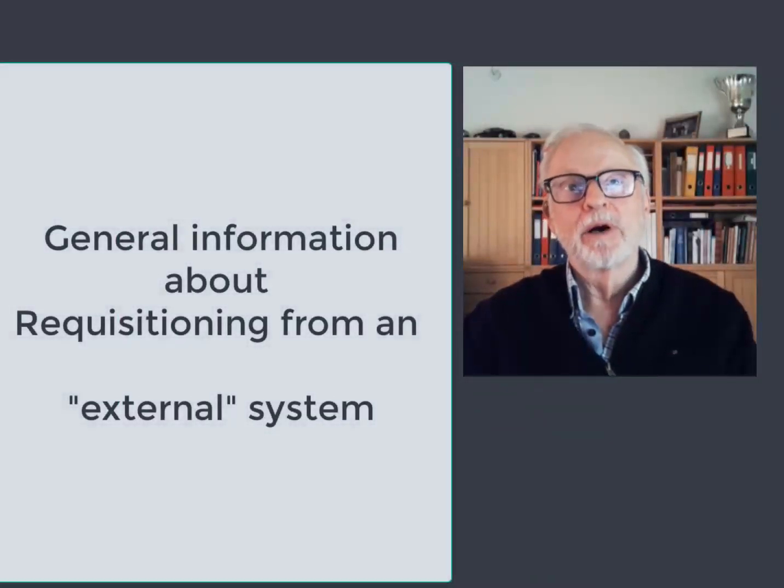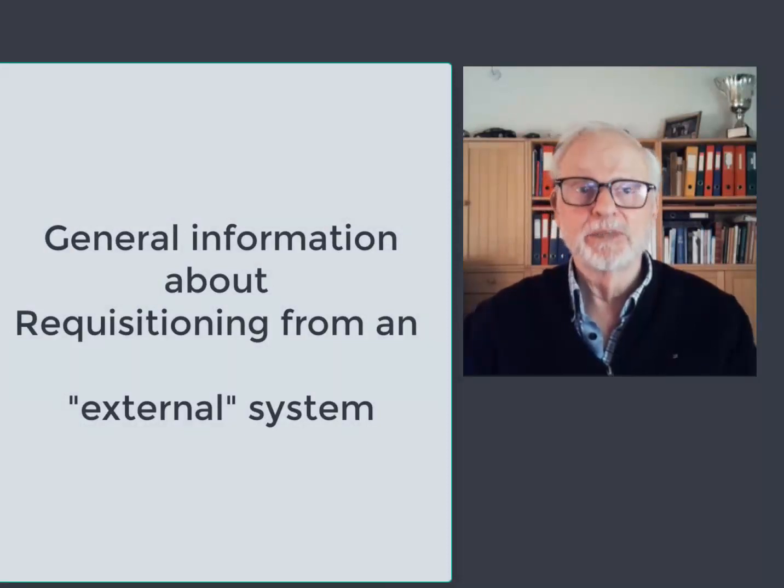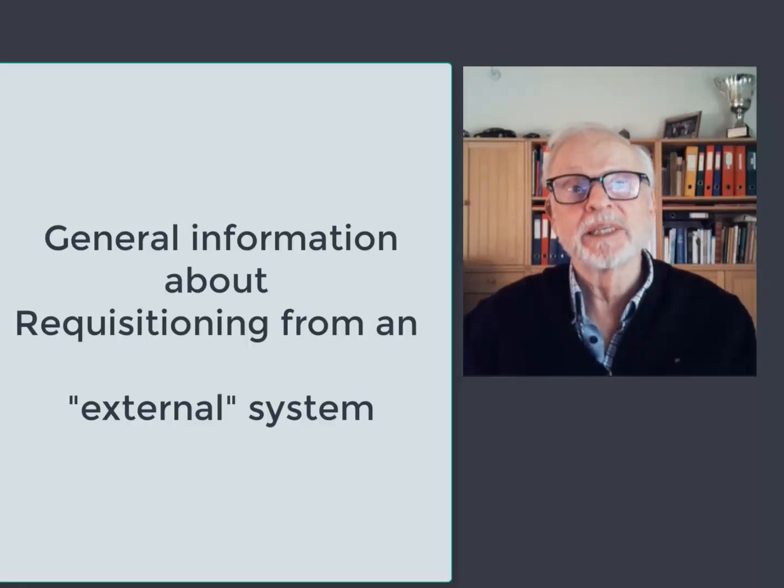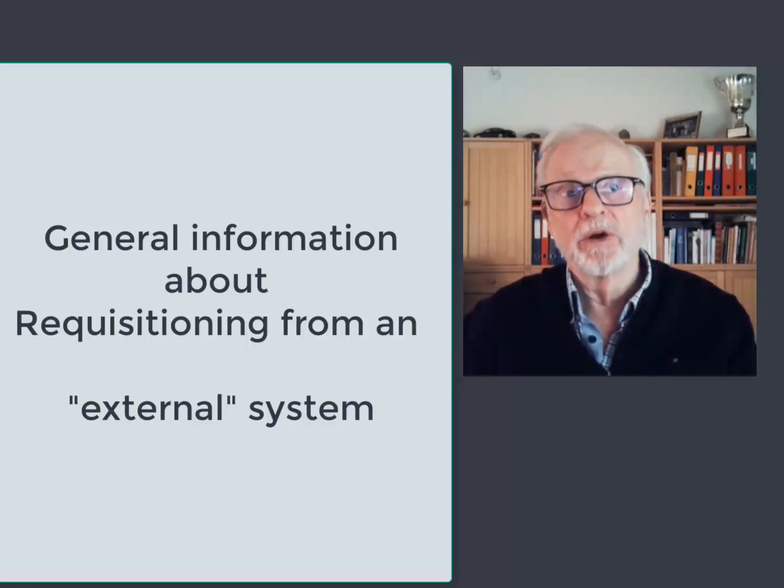A bit about requisitioning, first in general and then in LSP. The requisitioning process in a laboratory system via an external system can have very different designs. The most primitive form can be, for example, creating the requisition information in the hospital information system and then sending it to the laboratory and waiting for accepting return responses, but only for the analyzers you have been ordered.